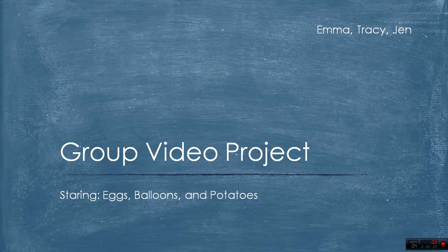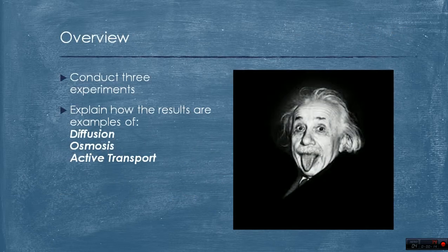This is our group video project about osmosis, diffusion, and active transport, starring Emma, Tracy, and Jen. We conducted 3 experiments which explained examples of diffusion, osmosis, and active transport.